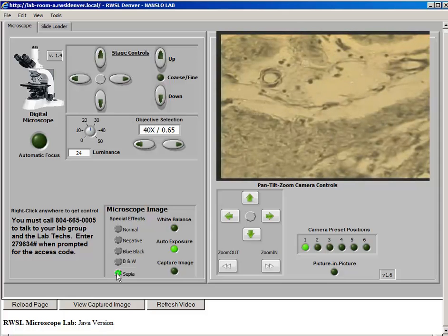In the sepia mode, a brown scale, black and white image of the sample is displayed. Although typically this filter is of little utility, it can be employed to alter image color characteristics to improve the visualization of sample detail. At times, the sample may have an unacceptable color quality. Use white balance calibration to remove the color cast. This process is often referred to as white balancing.